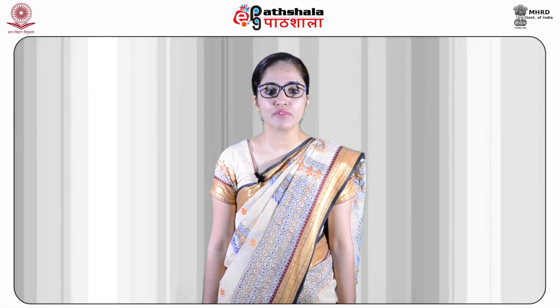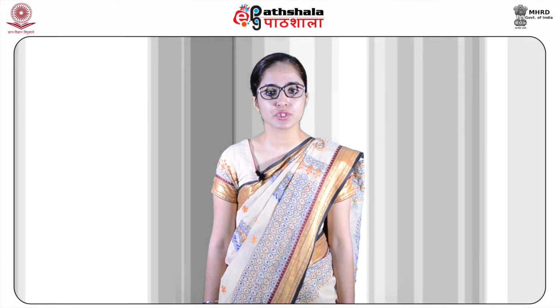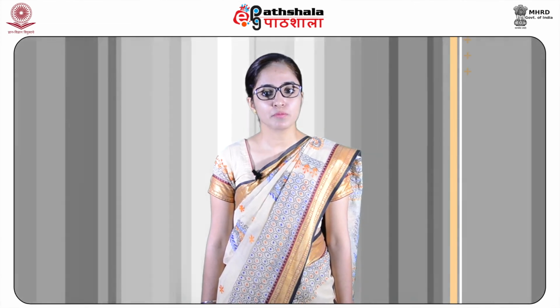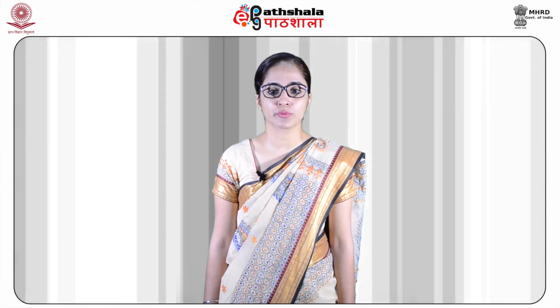They are especially valuable techniques when the structure of complicated natural products is to be considered and the conformation of biomolecules has to be determined. Out of these several experiments, two find the most frequent applications among organic chemists. These two are proton-proton correlation spectroscopy, abbreviated as COSY, and 13C-proton correlation spectroscopy, that is heteronuclear correlation, also known as HETCOR.